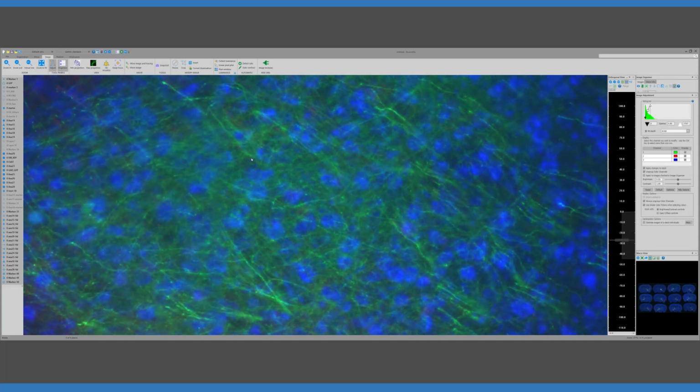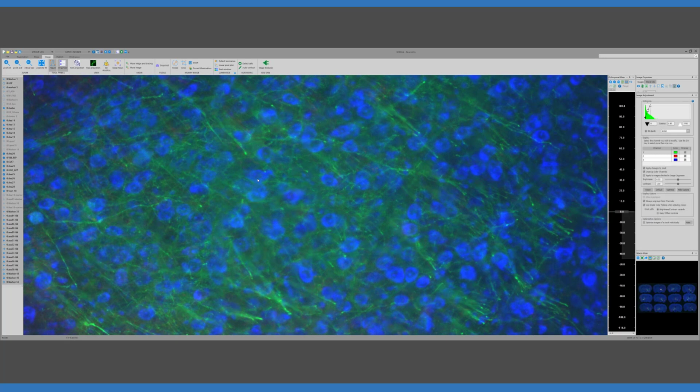And so what we do is we collapse the stack of images for the whole slide using a process called deep focus. And Brian, who wrote the algorithms and software for this, is going to describe that now while I turn it on and run it. You're turning it on.